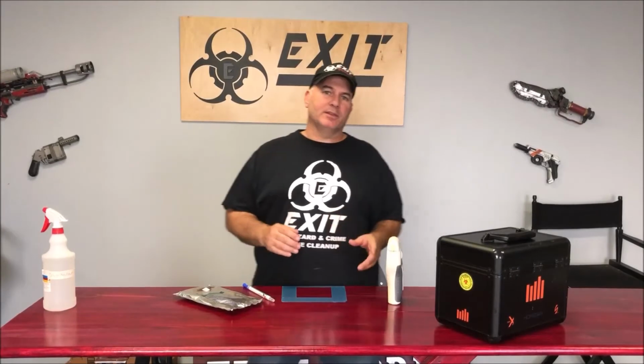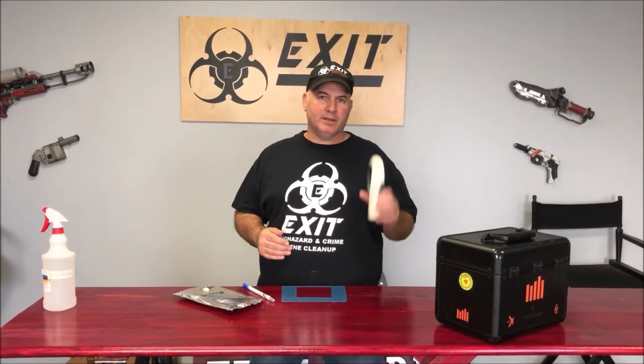Hi guys, I'm going to try not to make this boring, but we're going to talk about ATP testing.